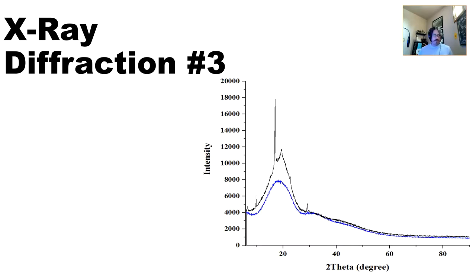Everybody, welcome to our third lecture on X-ray diffraction. I'm going to get my laser pointer going so I can talk about the first slide of the lecture for today. A lot of times I talk about this class being about being able to differentiate between black and white, or contrast, to analyze the data output by our characterization instruments.